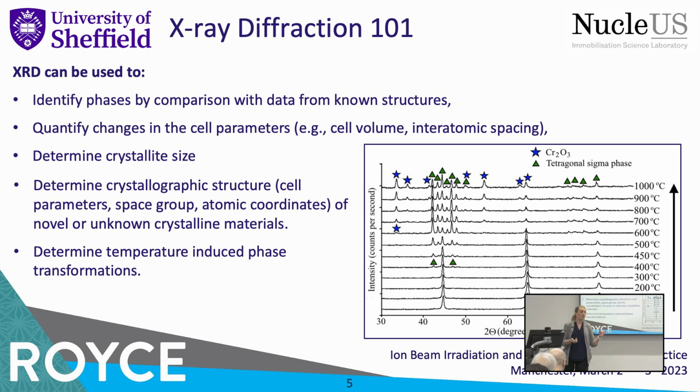You can also use XRD to determine the crystal structures of unknown materials. There, of course, you're not going to match directly onto a material because you're making a material that no one's ever made before, but you're able to do some fitting within the software that allows you to say, hey, what is this crystal structure, even if the composition is different? So XRD allows you to characterize known materials, but you can also get a lot of information from unknown materials if they're materials that you're developing for the first time.